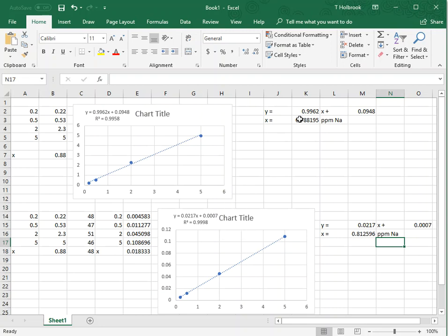And out of these two answers, the 0.812 is going to be the one that I would want to use and report as a value. If I took the trouble in doing an internal standard, I'm going to take the trouble in solving for that one using my samples and reporting that data, because on the books, as far as the science goes, this is a more solid, a stronger foundation as far as data is concerned.